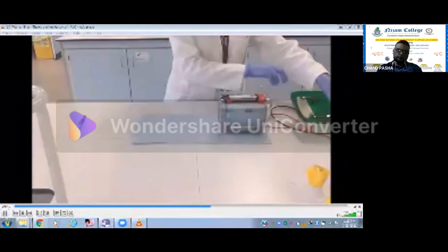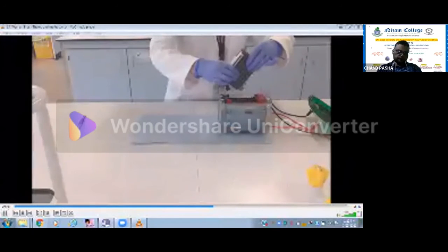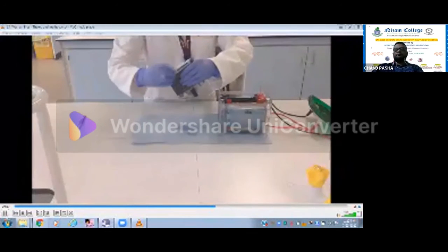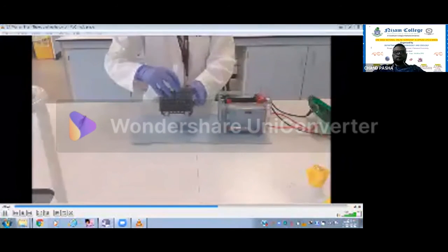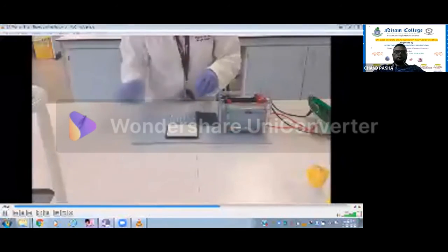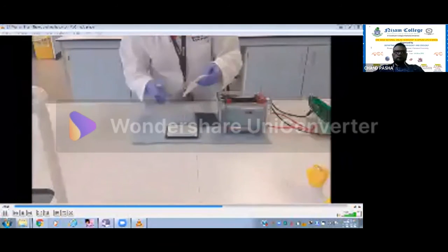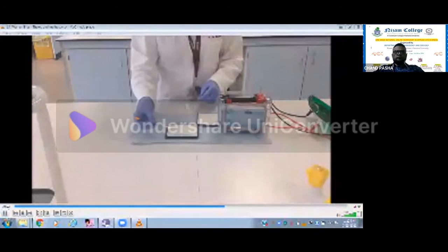Once the transfer process is complete, you can remove the lid and then remove the blotting module. If need be, you can squeeze the module to remove any excess transfer buffer. You must then carefully unclip the module. You can then place the module down, ensuring that the black side is on the bottom. Then remove each individual layer until you reach your nitrocellulose membrane. From here, you should be able to see whether your proteins have transferred successfully or not.